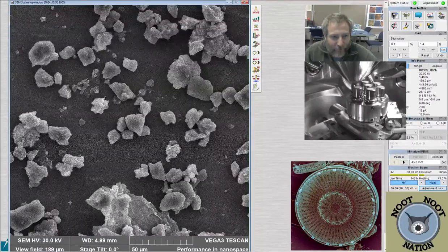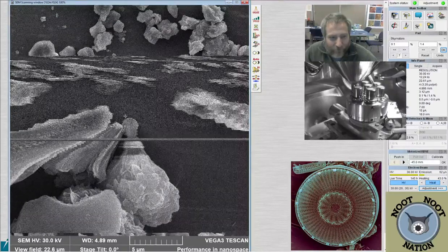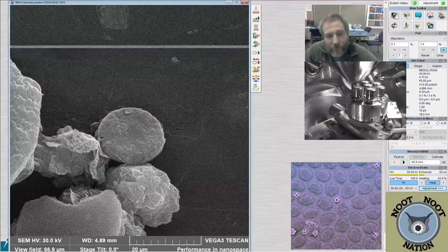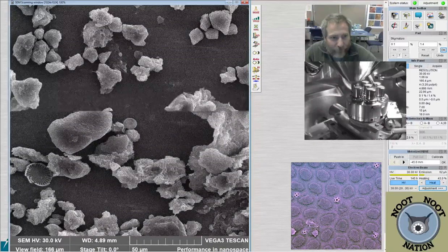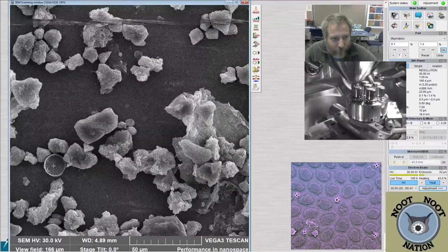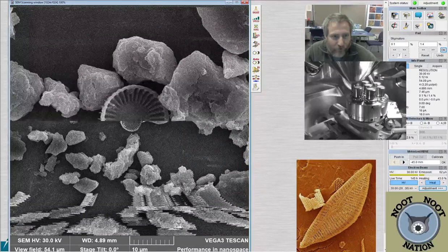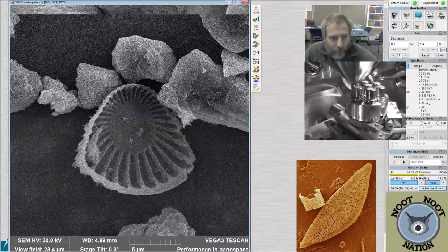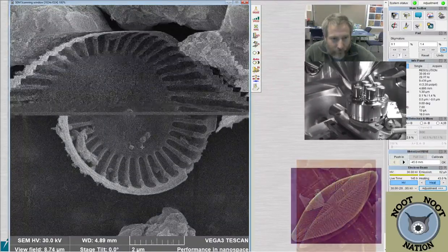Some aerodynamic process, which probably means that often we see internal rather than external views, because as they fall through the water column, they usually flip over. So, oftentimes we'll get more internal views than external views of any diatoms, because they're cup-shaped. And we finally got a decent view of the inside of a Cyclotella meneghiniana here.